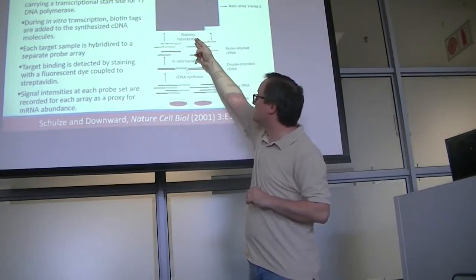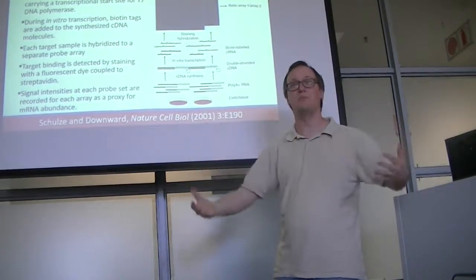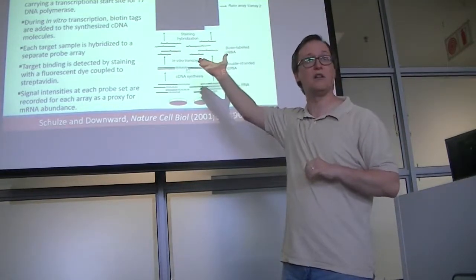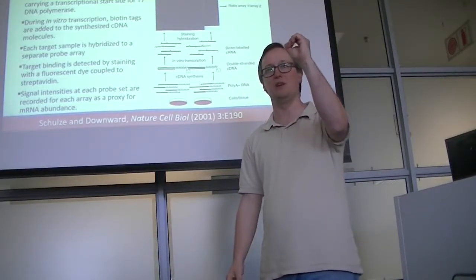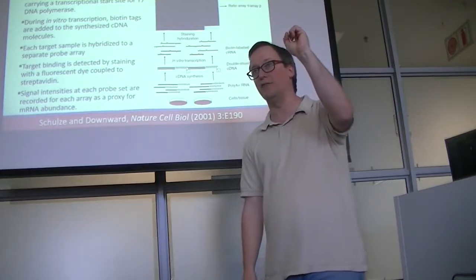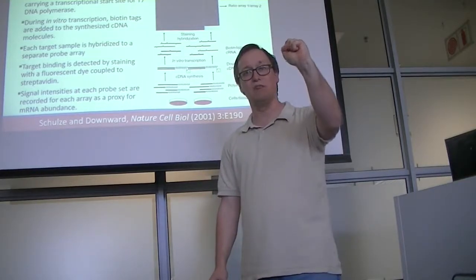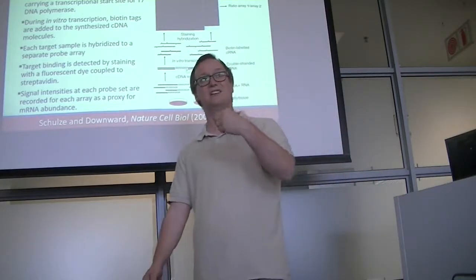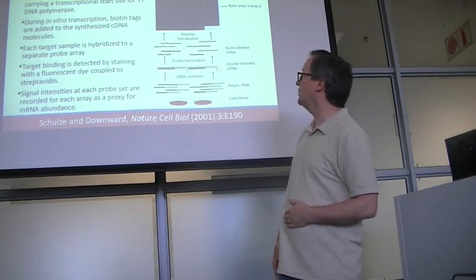So we frequently will see that different samples get separated to different microarrays. As a result, we have a monochromatic single color analysis. On each microarray, we're simply asking, is this probe sequence, this particular set of complementary DNAs, bright or dark? If they're dark, we assume there's very little detection here. If it's nice and bright, that tells us we have a gene for which the expression is relatively high. Okay.